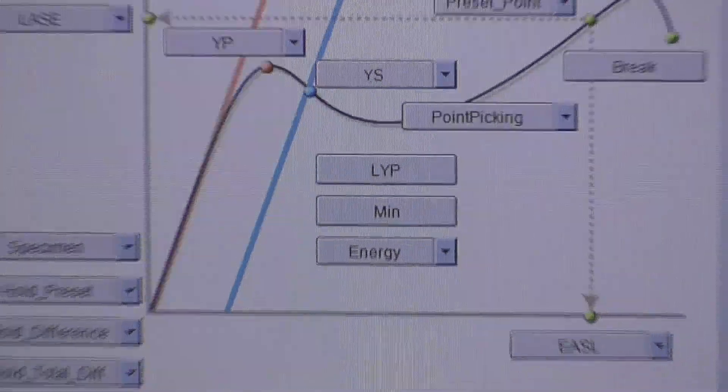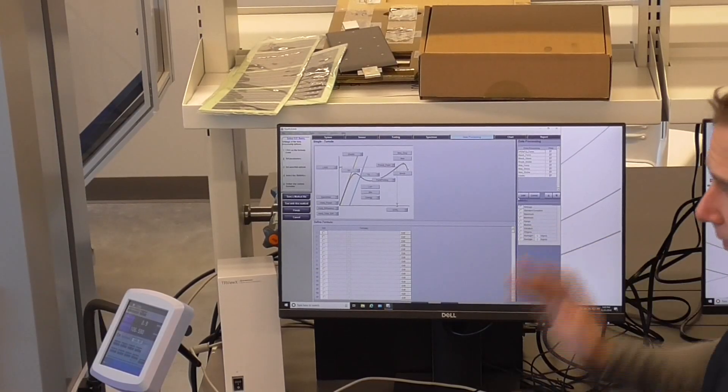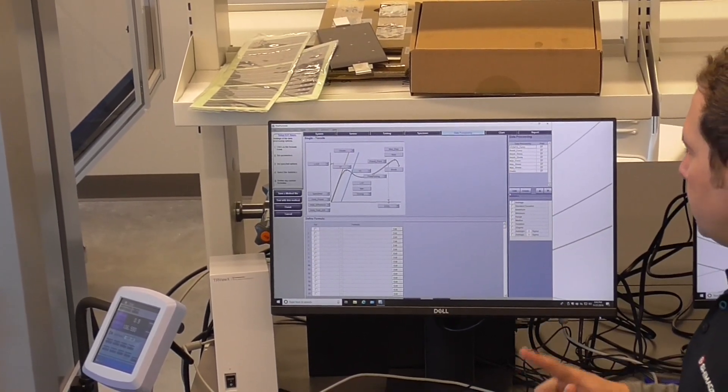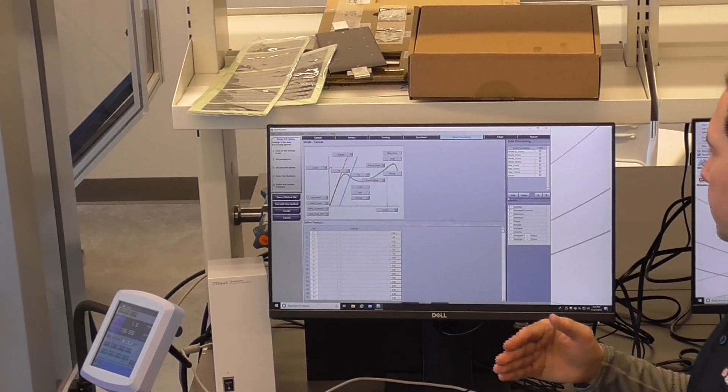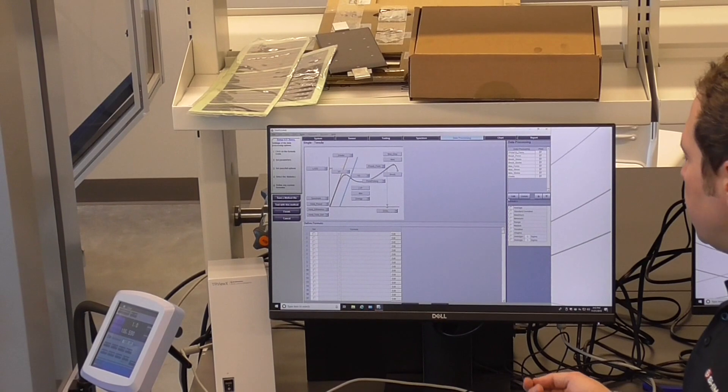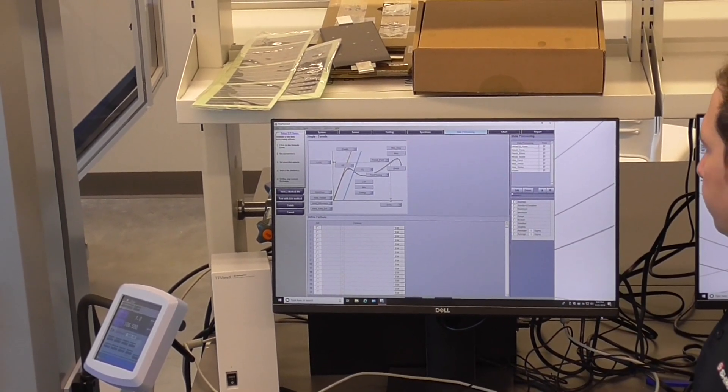In addition to your data processing parameters for this screen, you can select your statistical analysis for each of those data processing parameters. So this includes your average, standard deviation, maximum and minimum within that test batch. You can also get to some more eccentric things like your six sigma values as well.